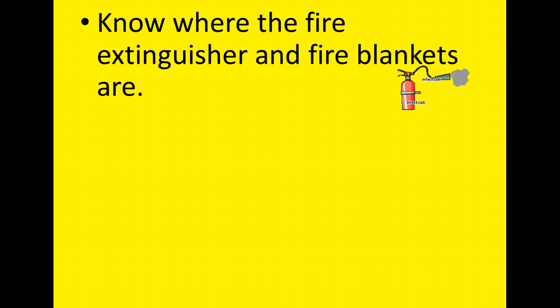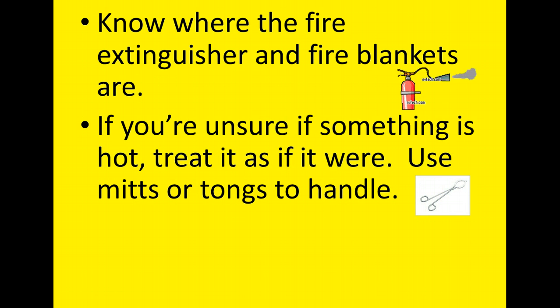Okay. Next, if you're unsure if something is hot, treat it as if it were. Use mitts or tongs to handle. A lot of times you don't know by looking at a pot or a glass cup if it's actually hot. I mean, how many times have you ever reached into the microwave and went to go pick something up and realized that it's burning hot? Or you turned on your stove and you didn't realize you put the wrong burner on, went and grabbed the handle of the pot and ended up burning your hand.